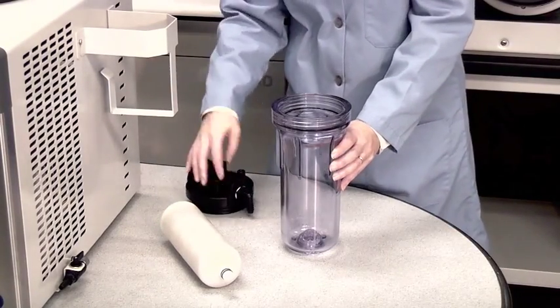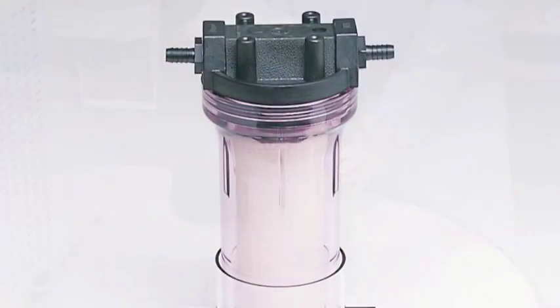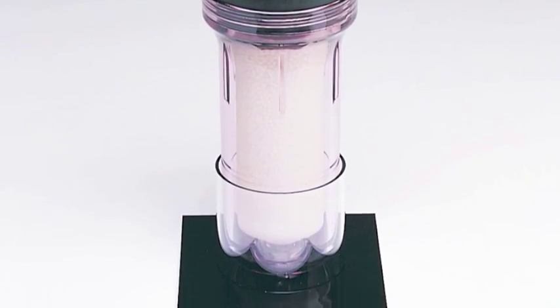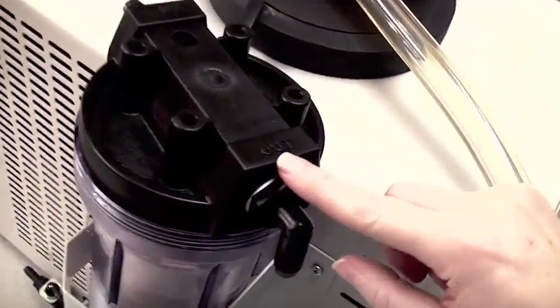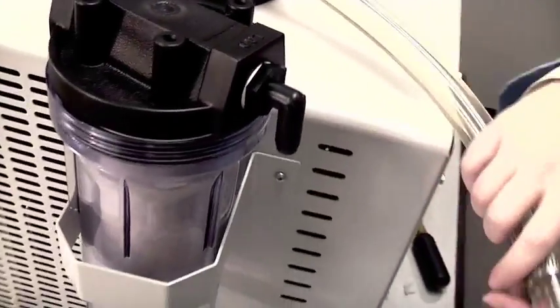Install the secondary insert into the canister and place it in the cold trap bracket. Attach the hose from the cold trap to the out connector of the canister housing.